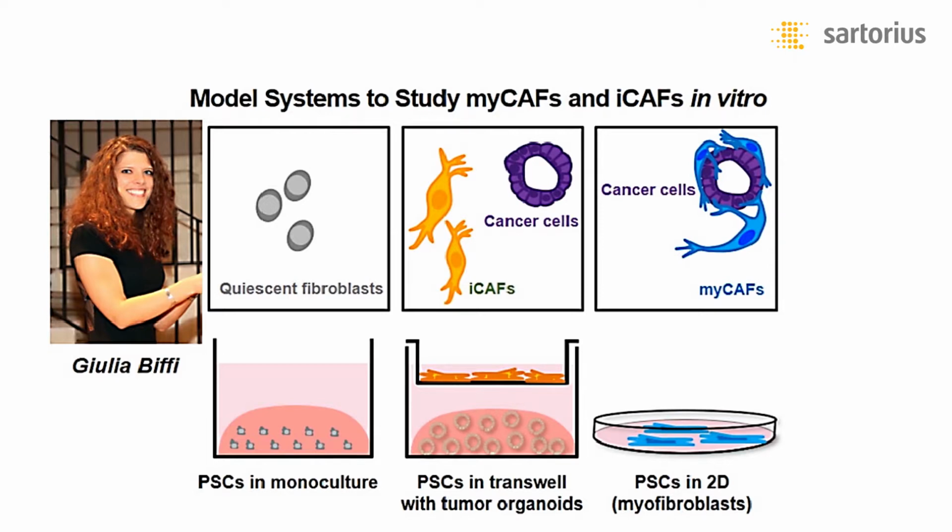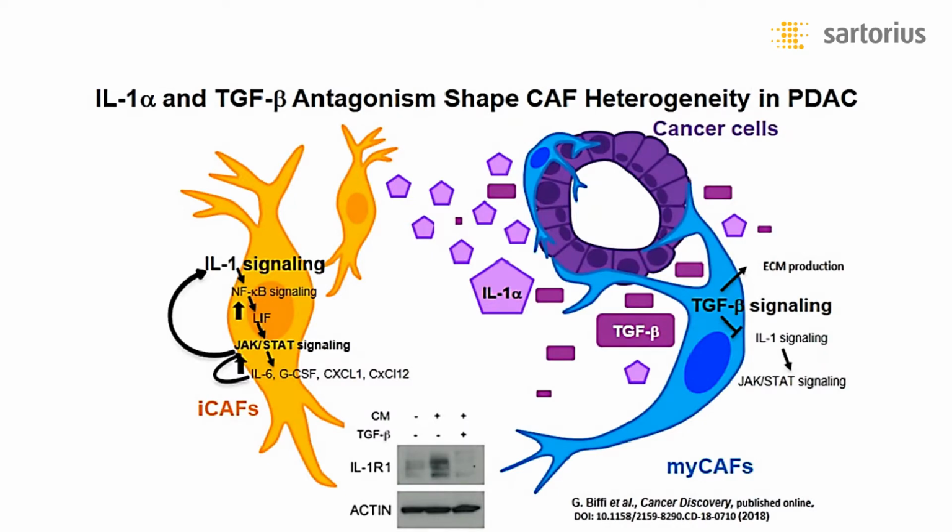And then to the right, again, myofibroblasts, very simple to generate them, essentially just by allowing them to contact a petri dish where the tension between the cell types appears to be something that helps readjust their differentiation pattern towards a classic cancer-associated fibroblast. So Julia, using this system, was able, in the next slide, to show the mechanistic underpinnings of these two types of fibroblasts. And so this next slide should show you a cartoon. This is slide number 8, where you have the inflammatory fibroblasts on the left and the myofibroblasts on the right. Inflammatory fibroblasts are yellow, the myofibroblasts are blue.